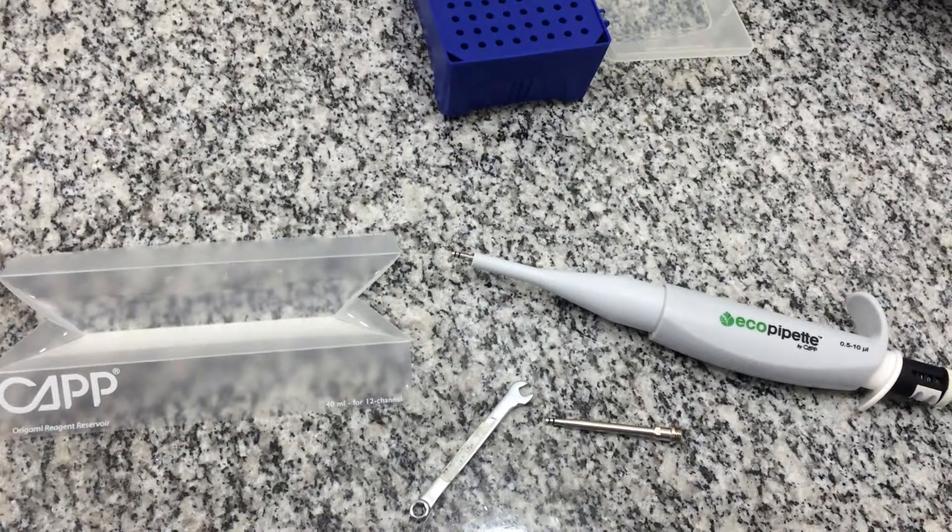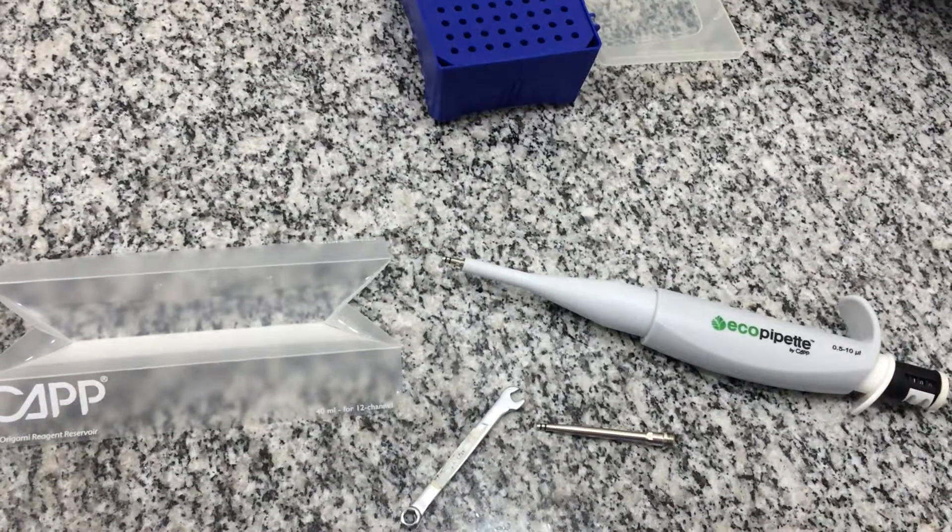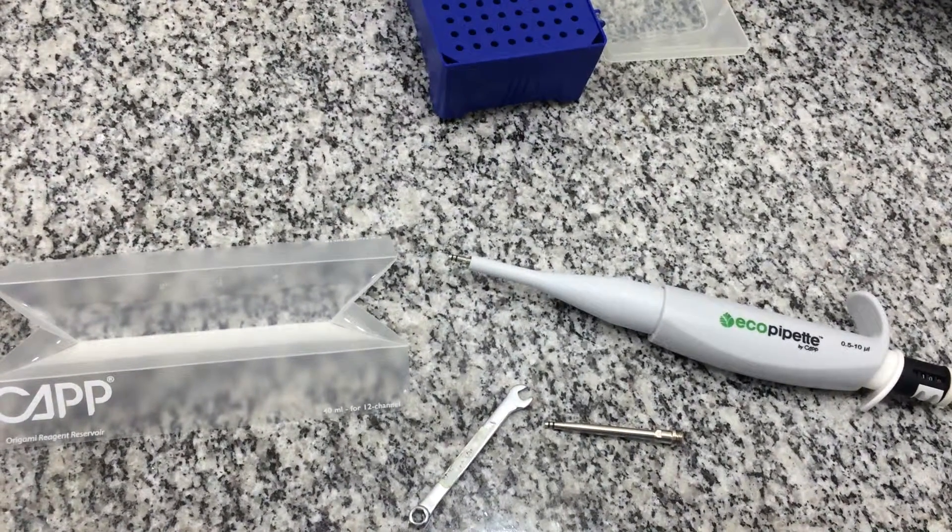Today we are going to troubleshoot the Kappa Aero and Eco Pipette 0.5 to 10 µL. Make sure you have watched the functionality test video prior to this one.